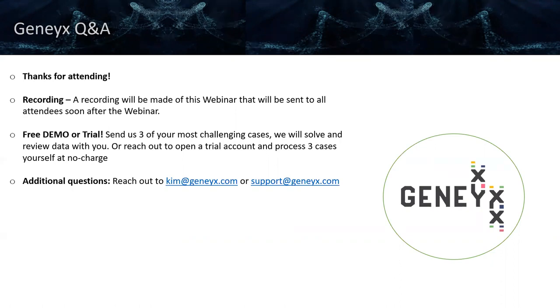Yes, that's a great question. We actually have protocols that are specific to somatic workflows. So for example, if you wanted to work with a tumor normal or cancer only, we do have protocols that can assist in that. And we provide you with relevant cancer databases, as well as if you want to integrate your own customized database, you have the ability to do so.